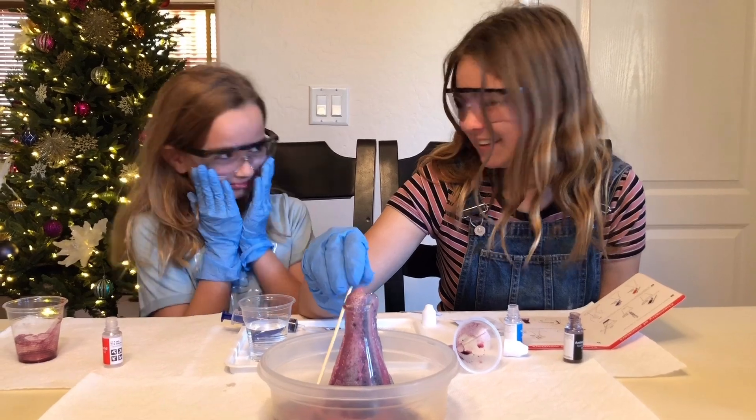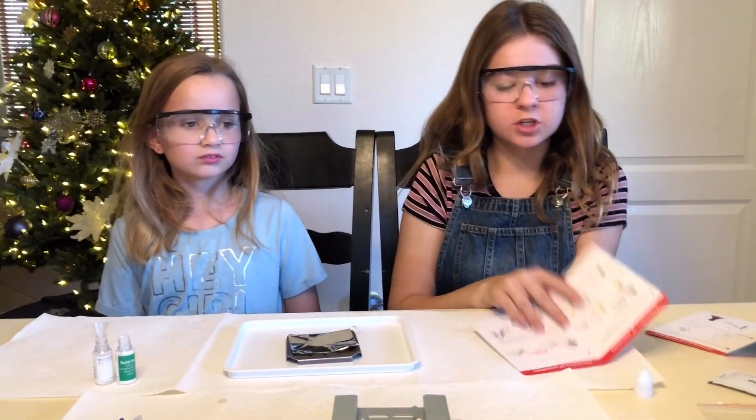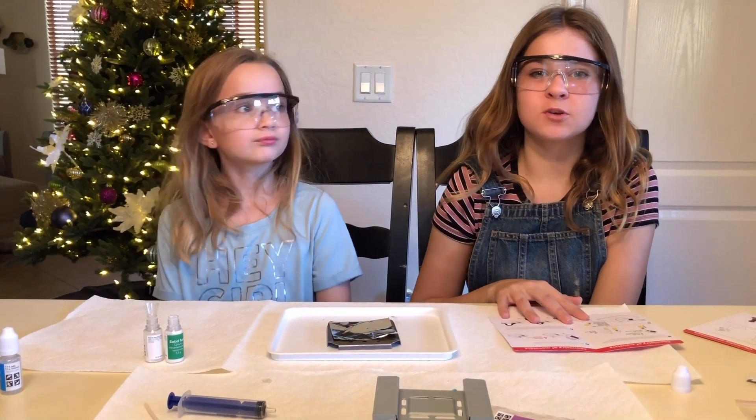So now we have one more experiment left from the chemistry set, which is the carbon snake. This one you will need a parent for because you'll be working with fire.